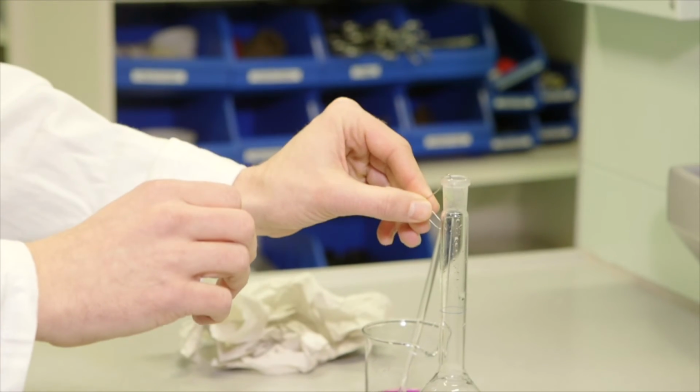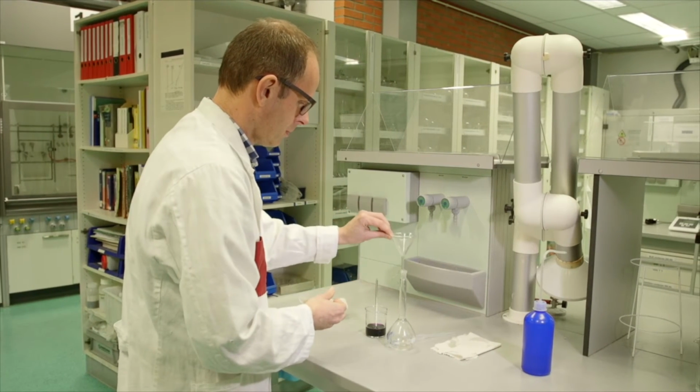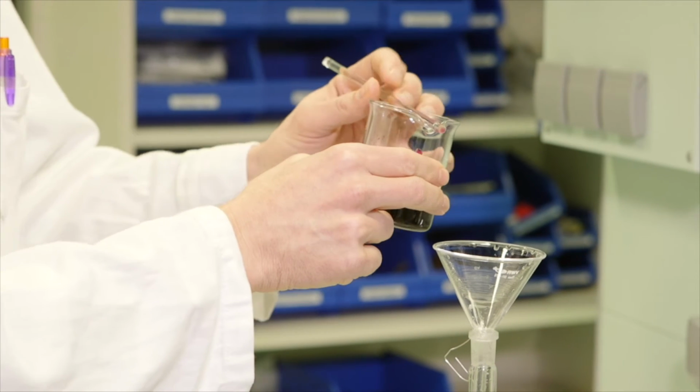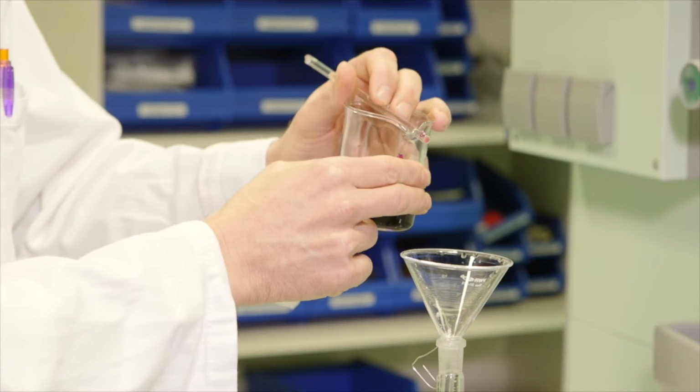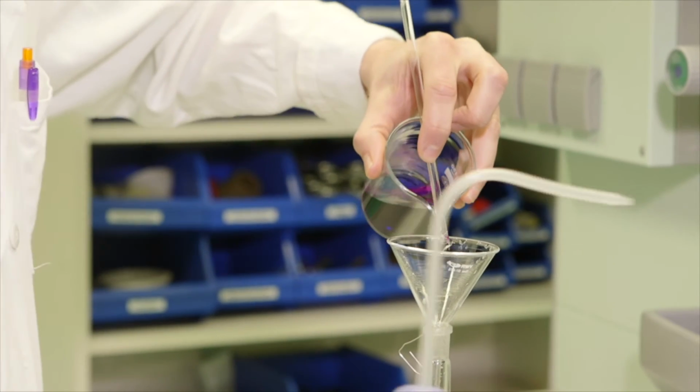As soon as there is liquid in the flask, the air must be able to escape, and this can be done through the outside of the funnel. The stirring rod is placed at the mouth of the beaker. Your index finger holds the stirring rod in place. The other hand rinses the beaker with demi-water from the squeezy bottle.